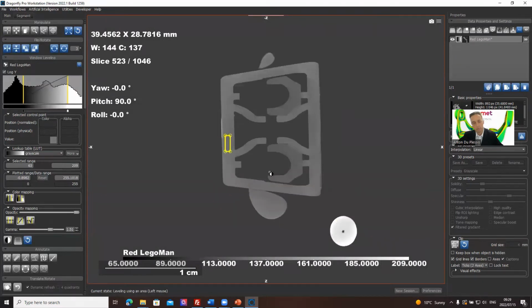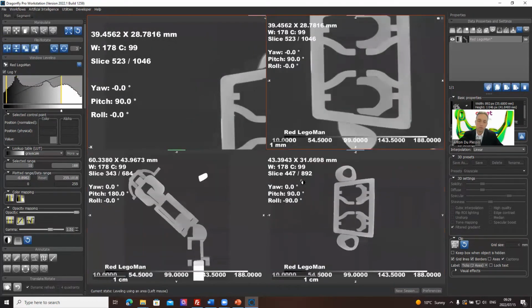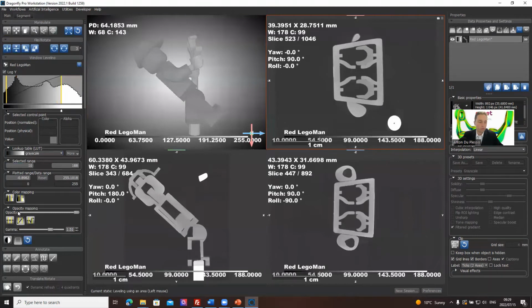There's different ways of doing that. Okay, so we're in the contrasting functionality, as you see with the icon there. So we have to press the escape key to get back.